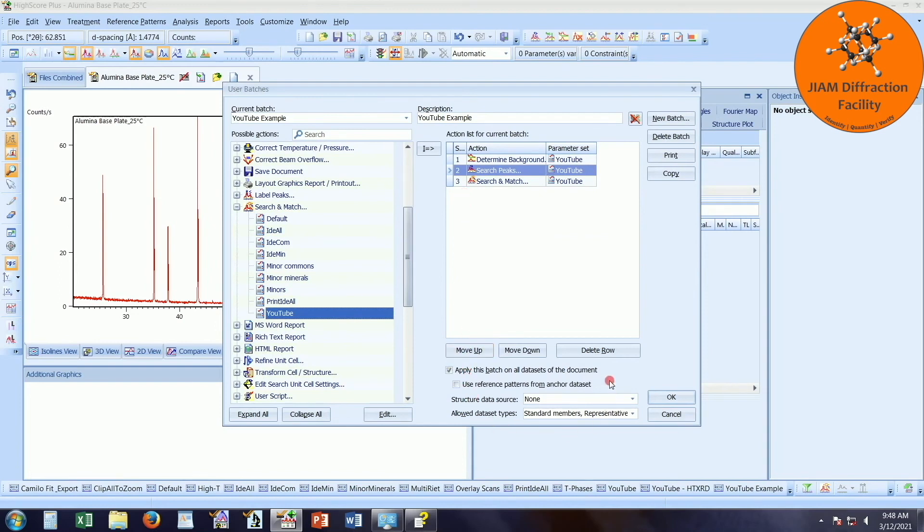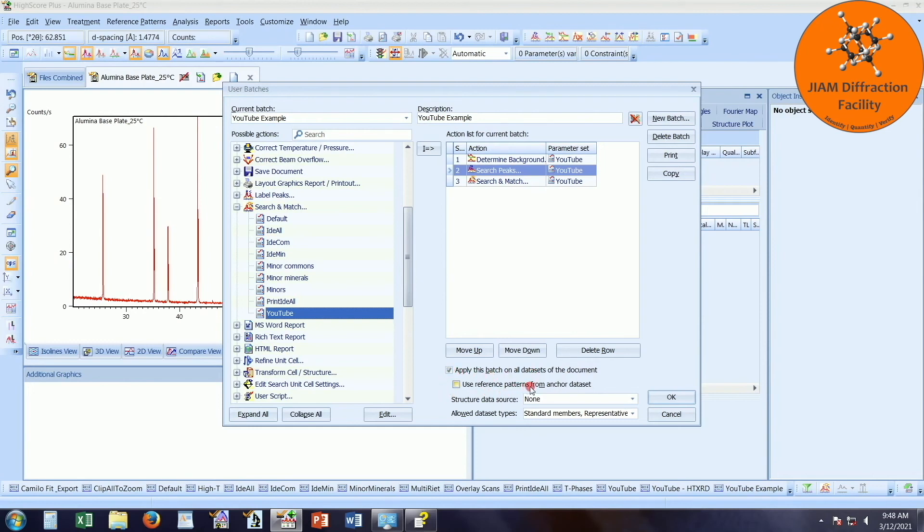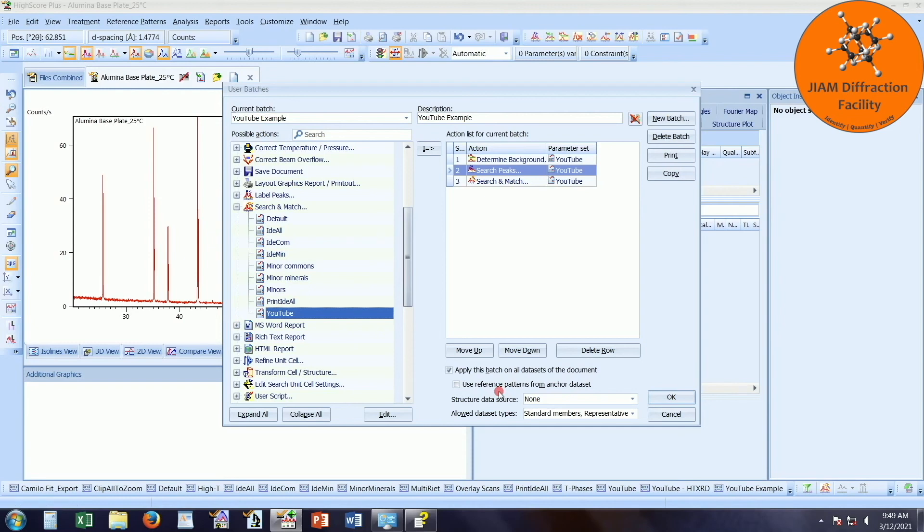A couple more things down here. We have a few options. Apply this batch on all data sets of the document. We want to analyze all of our data sets. So we want to make sure that this is check marked. Use reference patterns from anchor data set. That means that basically if you have that check marked, it will copy all of the reference patterns from the first data set into your other data sets. We don't really want that for this situation because our data sets have different phases. So I'm going to make sure that this is unchecked.